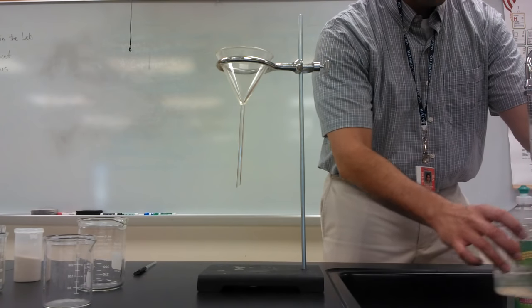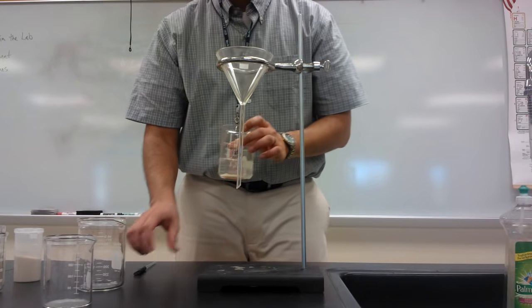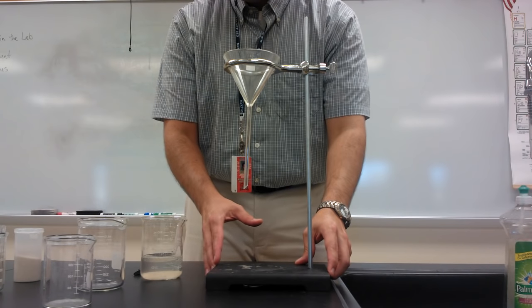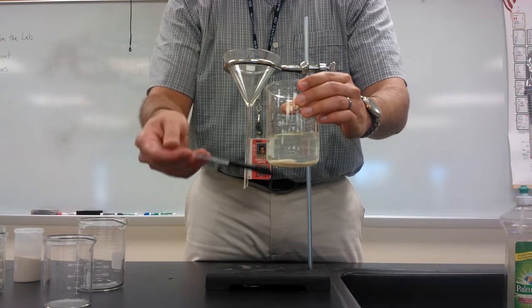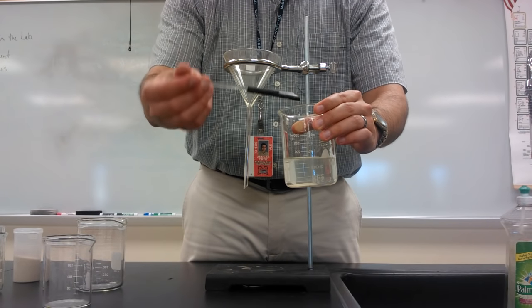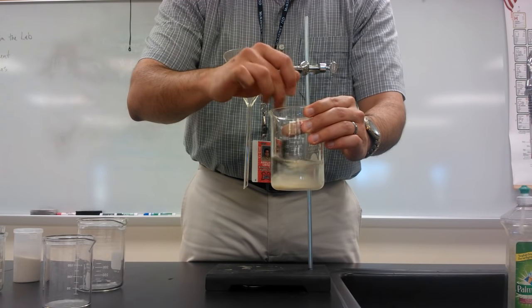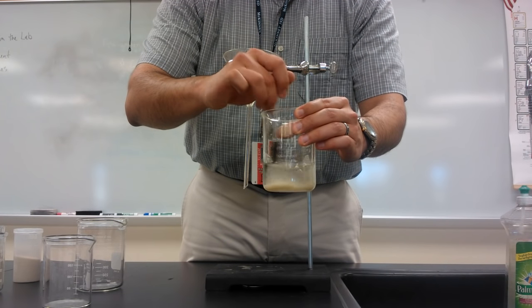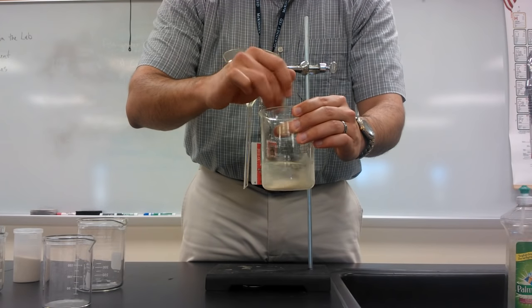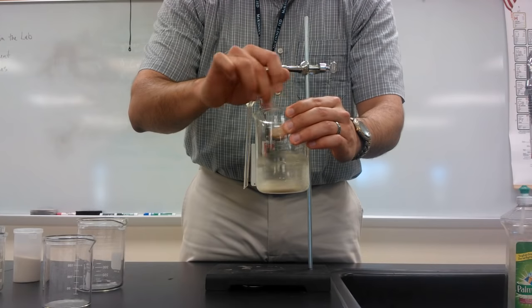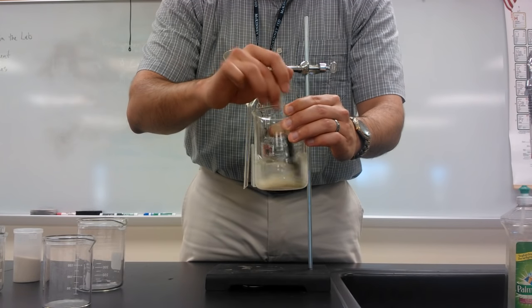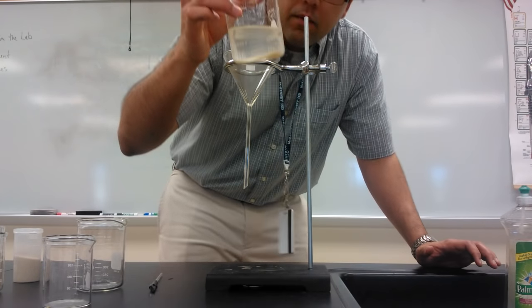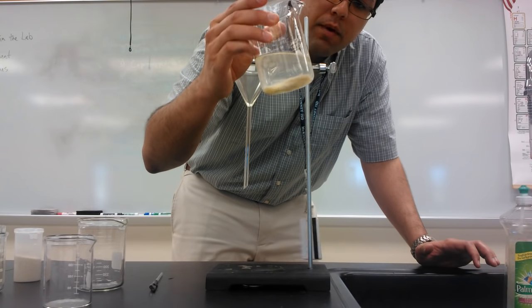So I am creating here what we call a mixture. You can see I've got a setup right here that I'm going to use later on. I've got my sand and my water in the beaker, and I've got my chemical spatula, and I'm going to use it to stir. So this is now a mixture. You may remember from biology or previous sciences — this is called a heterogeneous mixture because I can see the different parts. I can see the water and the sand. So I've stirred it long enough; this is a mixture, and I would like to be able to separate them as much as possible.